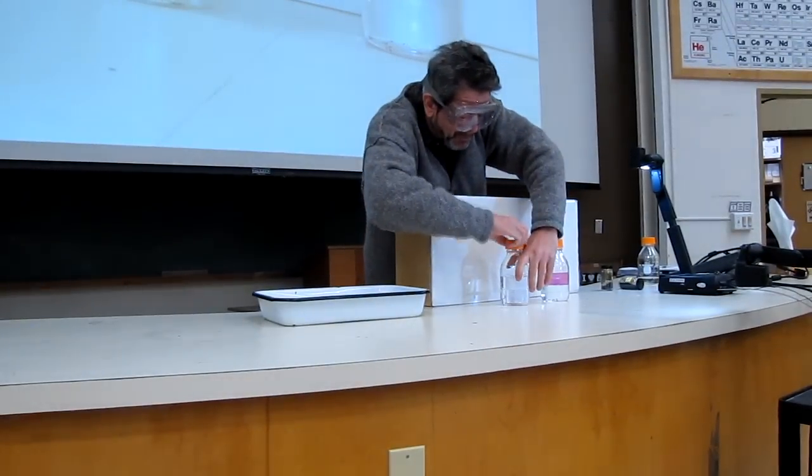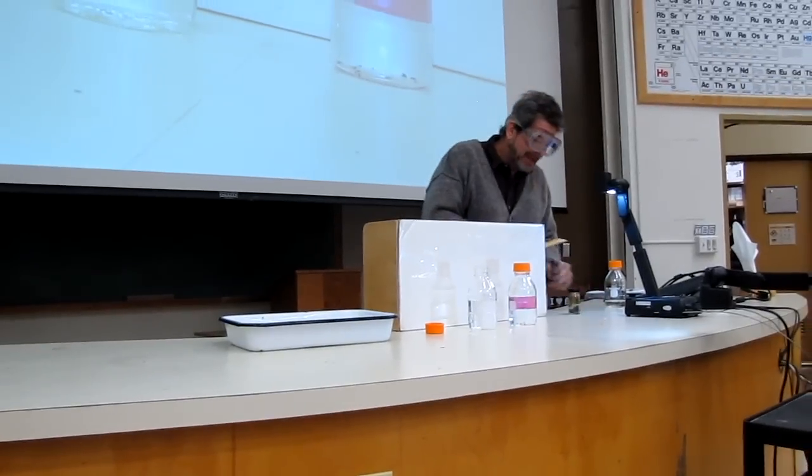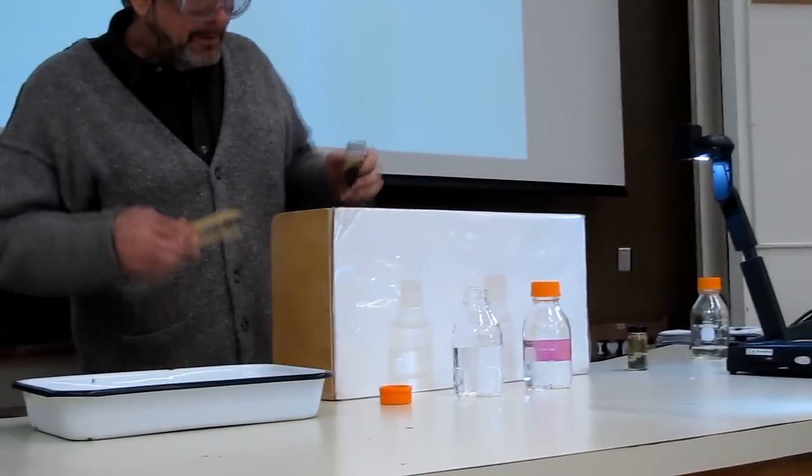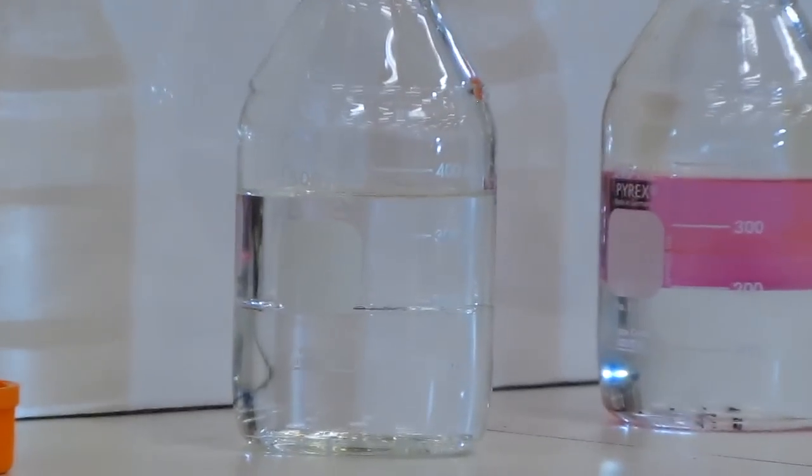So now let's take a look at permanganate. Let's dissolve some potassium permanganate in water. Take a few crystals, they're well into our system here.